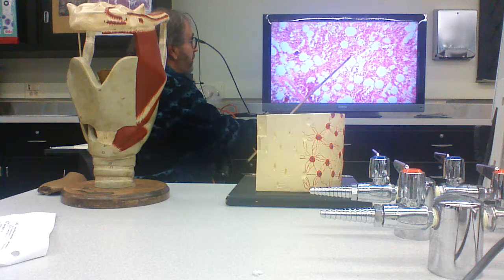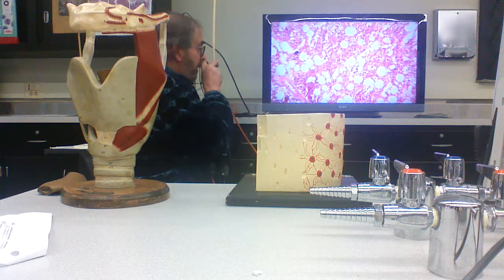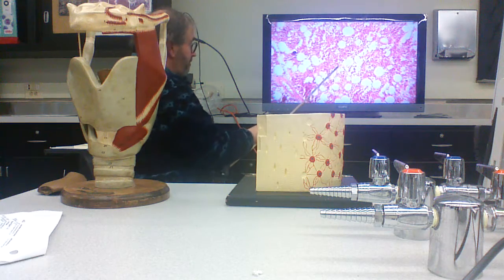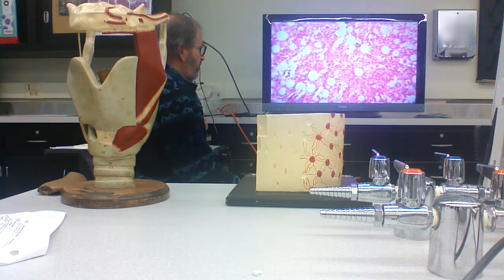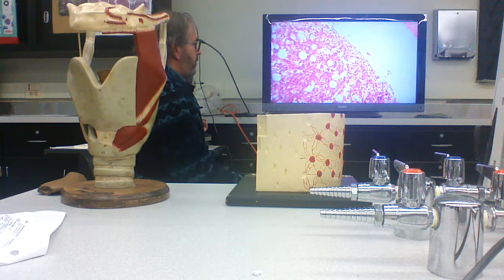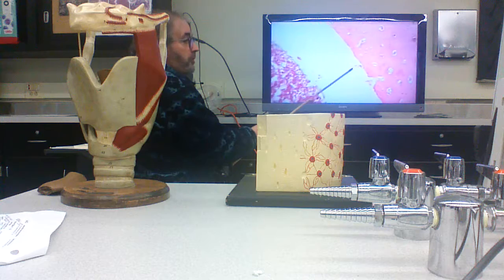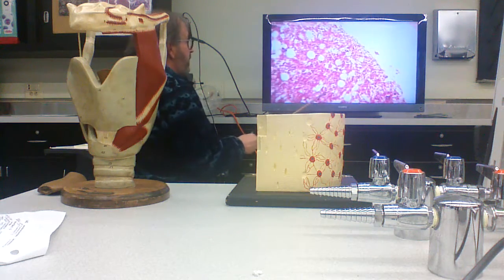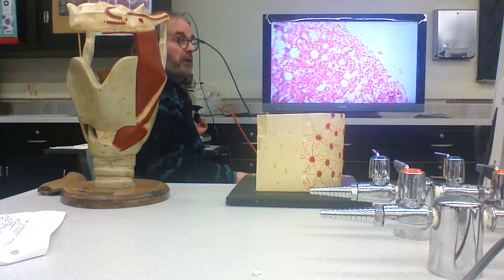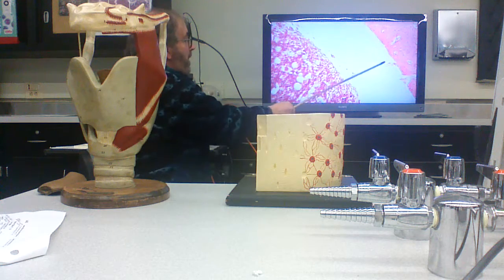As you age, the hemopoietic blood marrow, so-called red marrow, is replaced by fat. These are fat cells in there. Fatty marrow is often referred to as yellow marrow. What happened here is that osmotic forces in the preservative caused the bone marrow, which is another kind of connective tissue in itself, to contract and pull away from the wall.